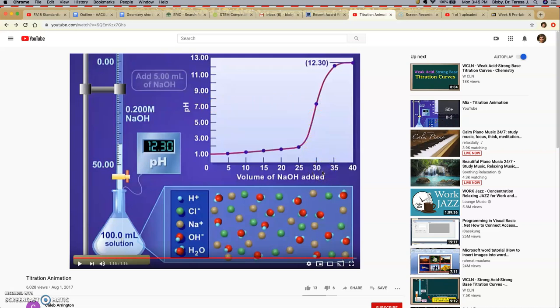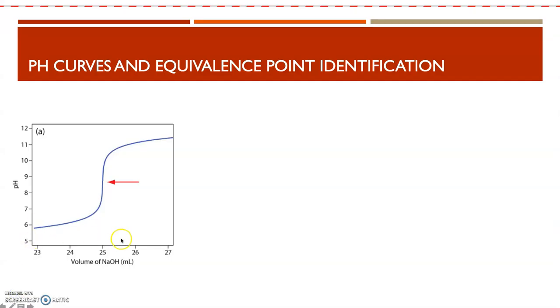But there are a few other ways to look at this as well to help you be more accurate. So here's that pH curve. We've gone past the equivalency point. Again, we can find the steepest part of that rise, the middle of the rise, and then come straight down and look at the volume that we used. This can be very hard to pick out.